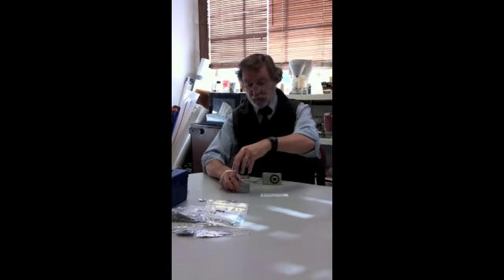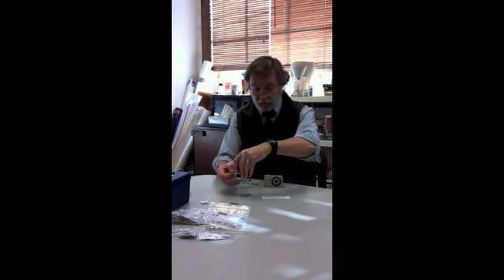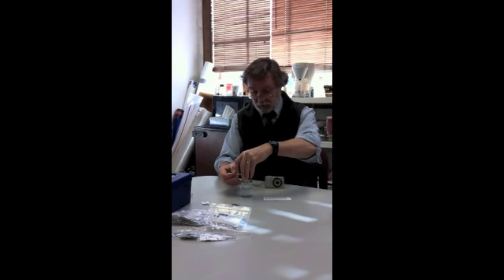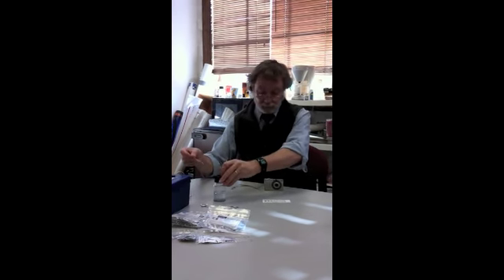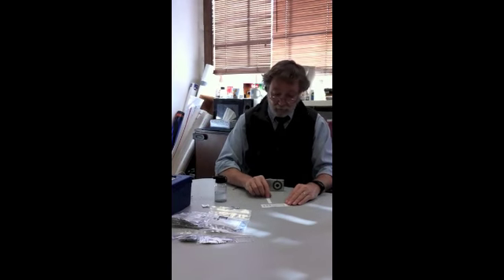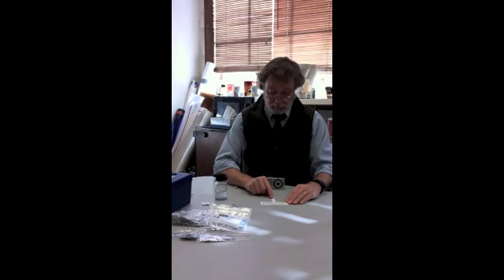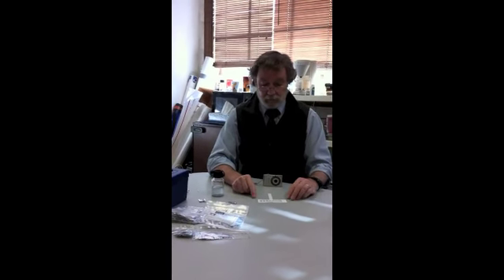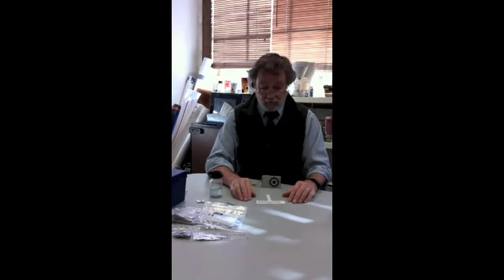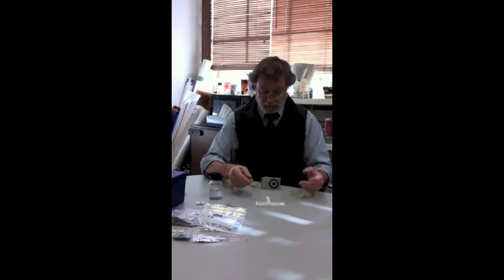So now that we've waited 40 minutes for the reaction to occur, the next stage is to remove the strip and to take a photograph of the result of the experiment. So just lift up the cap and remove the strip. And now you'll notice that there's a faint yellow color as a result of my analysis. The final part of the experiment that we're asking you to do is to take a digital photograph of this with the pre-printed color chart in the same photograph.